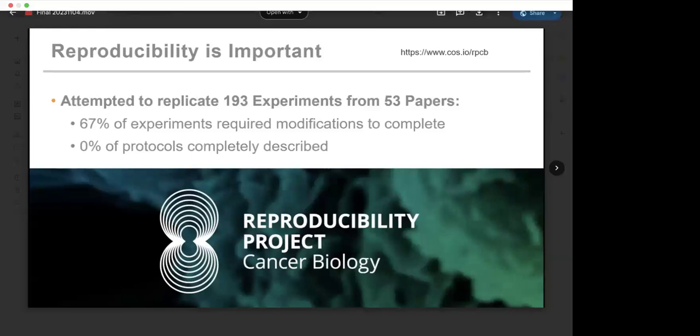What might be the problem? People use different equipment and consumables. Sometimes we have a certain way we do things or habits we don't think to write down. I may not realize that something about how an experiment is done is based on what's only in my head. There's also the environment: altitude, temperature, humidity can make a difference.